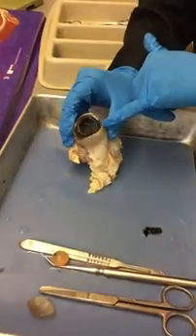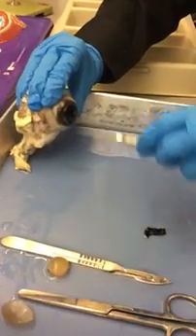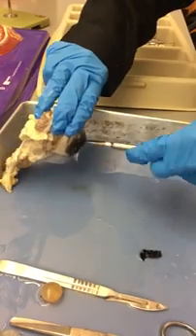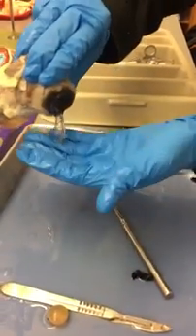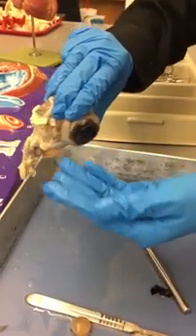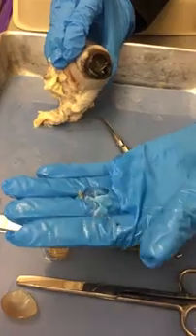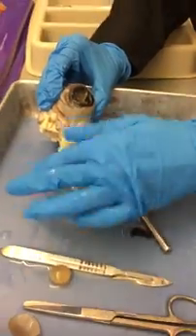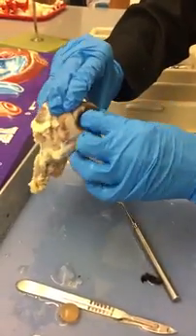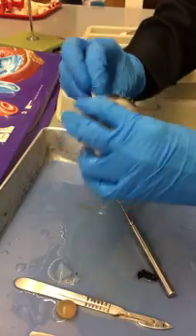Now, behind the lens is going to be the posterior segment of the eye. That's where you have what? Vitreous humor. Let me see if it's still there. You can see that gel that I'm pouring out. See the gel? That's the vitreous humor. It is gel-like, and this is what's going to help keep the retina pressed against the walls of the eye. So I'm going to pull it out. I'm going to try not to get the retina, because the retina is very delicate. Just trying to keep the retina in there.